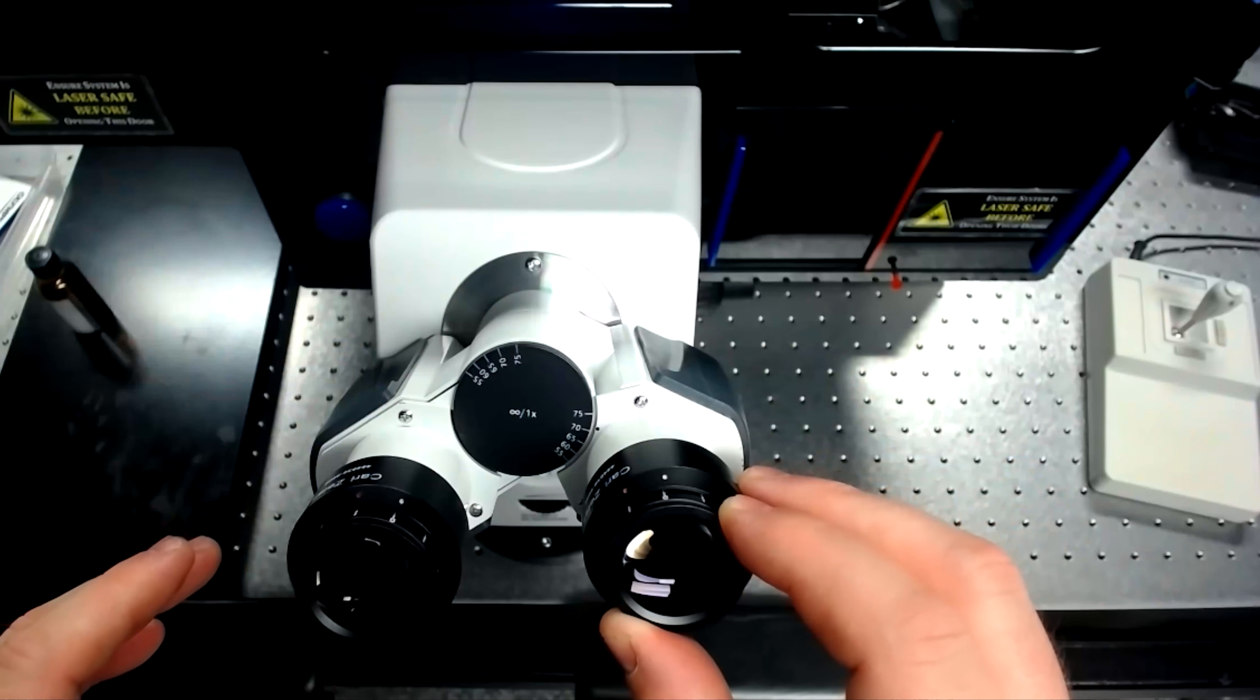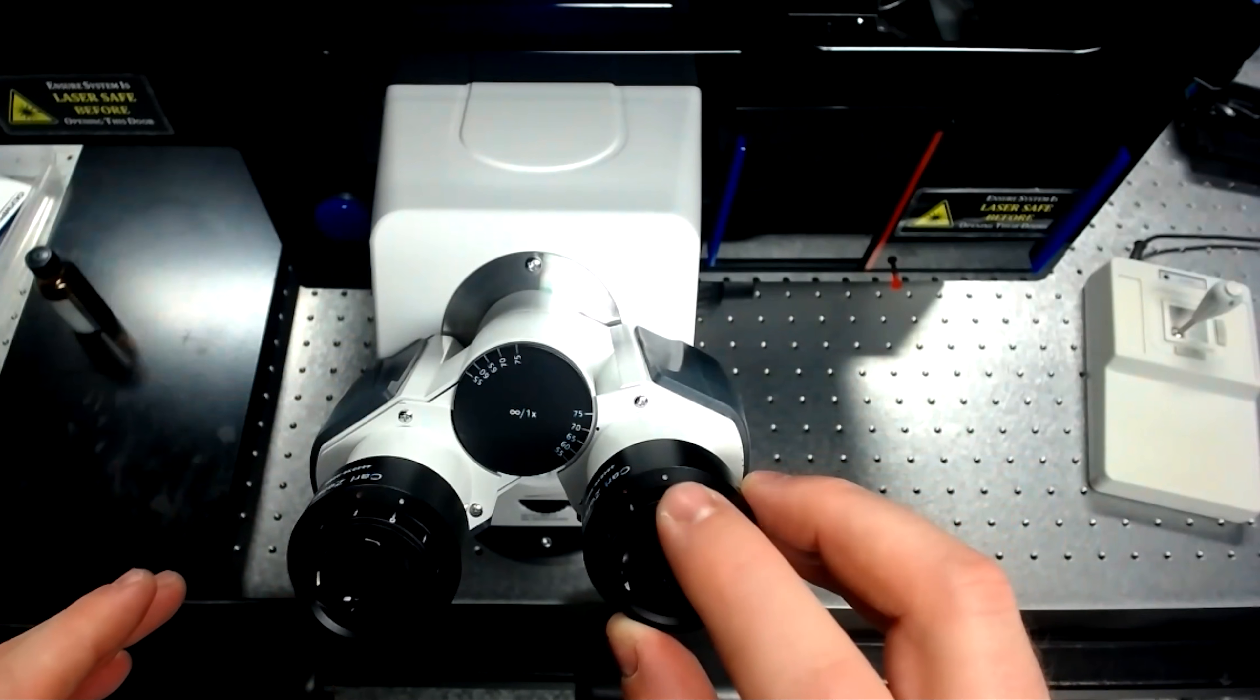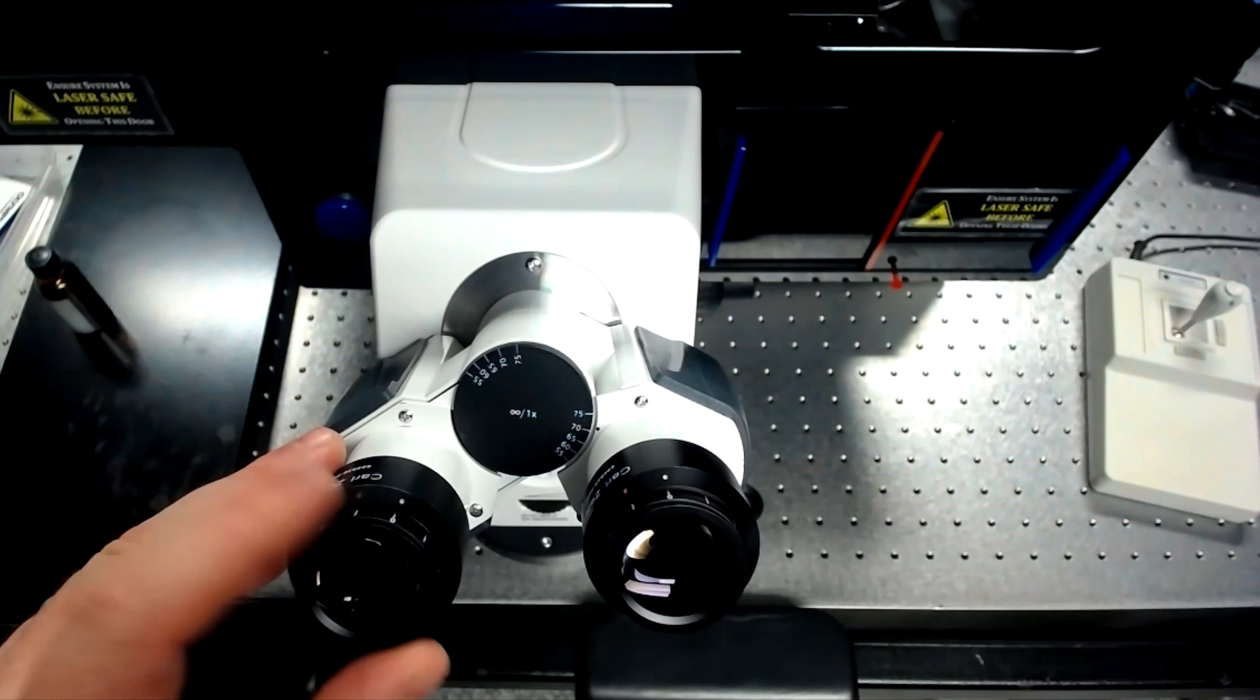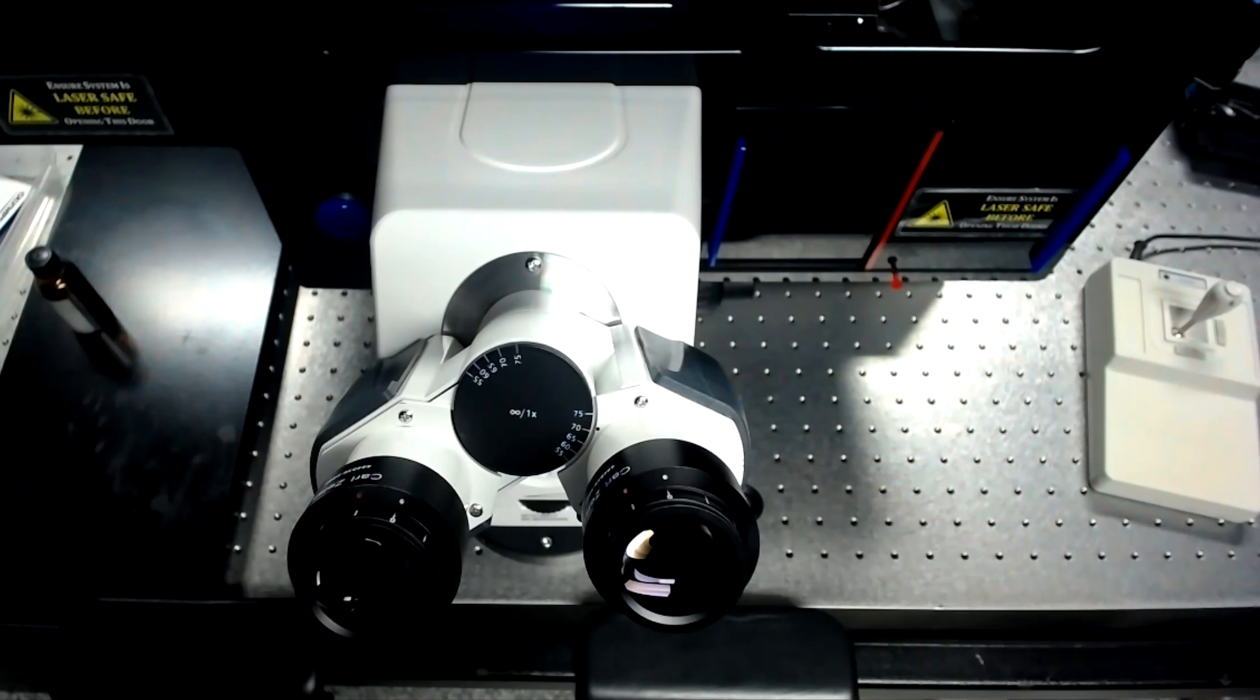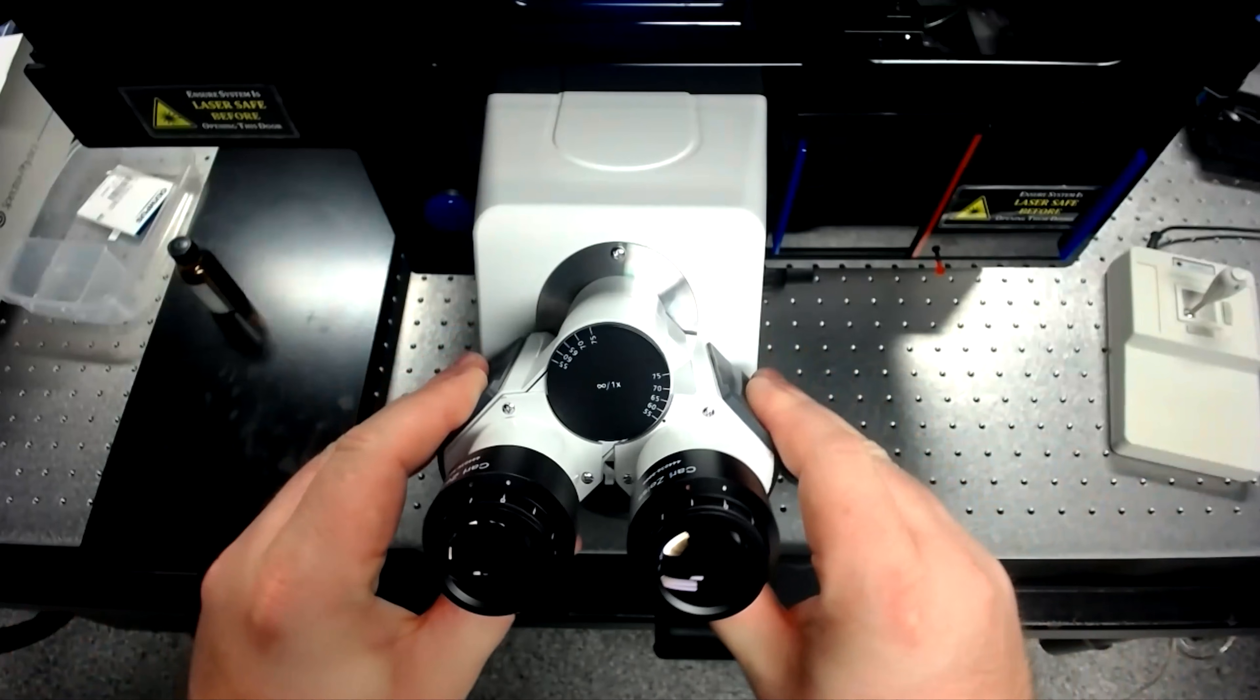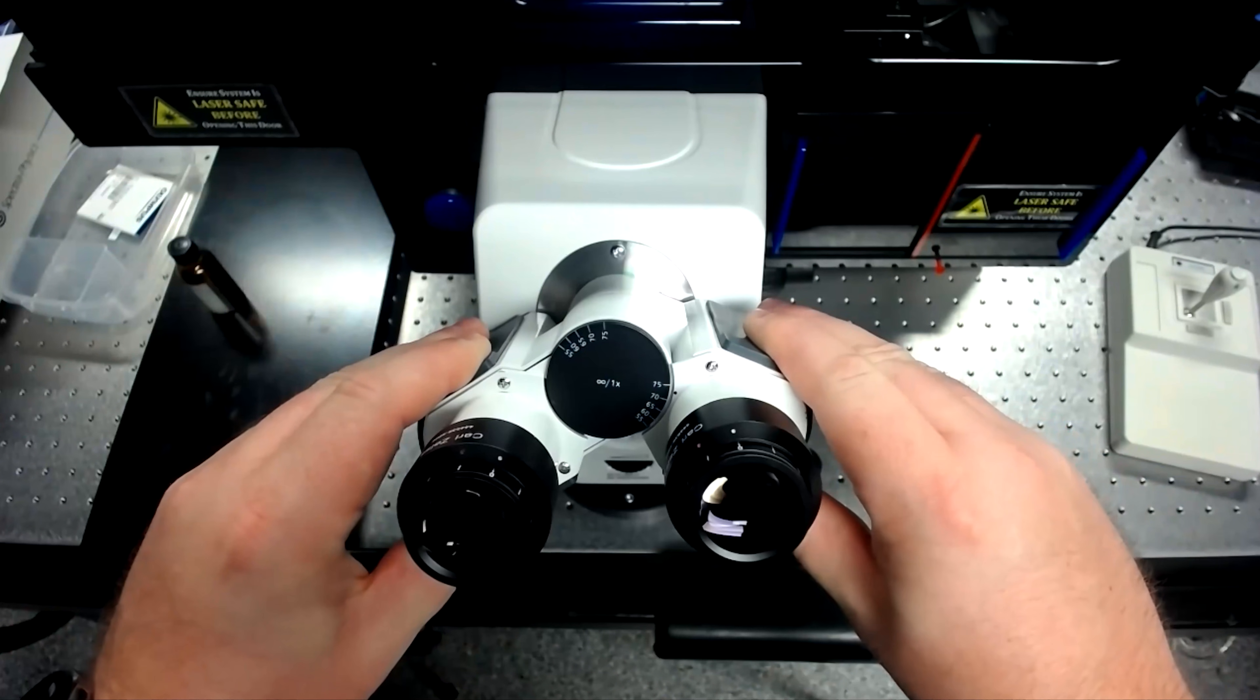The eyepiece diopters can be adjusted to suit your own eyes. Otherwise, they should be left at zero by lining up the white dot with the marked zero position. Additionally, the eyepieces can be adjusted to suit your interpupillary distance.